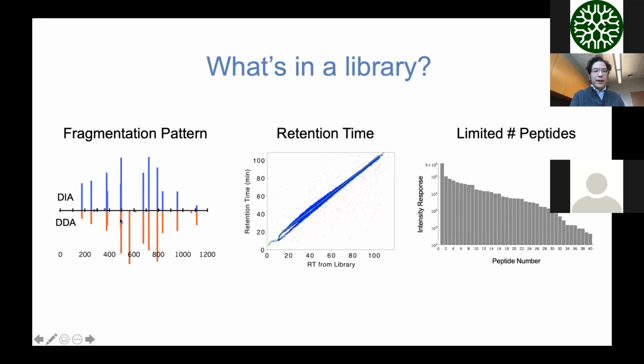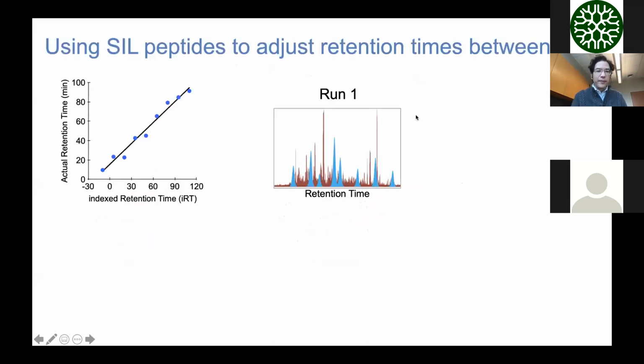But the measurement in DIA doesn't know anything about the charge state, and so the fragmentation patterns are still slightly different. You can see, for example, in this particular case, I've got a DDA spectrum where some peaks are present at slightly different intensity levels. But as long as the broad strokes are good, then it's a good circumstance. Okay, great. So that's a great question, Gian.